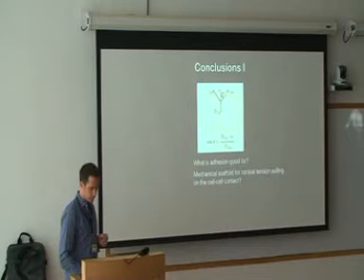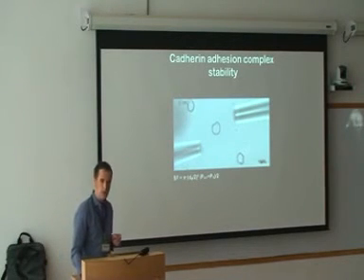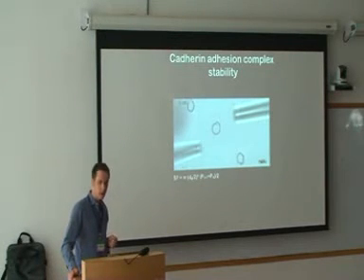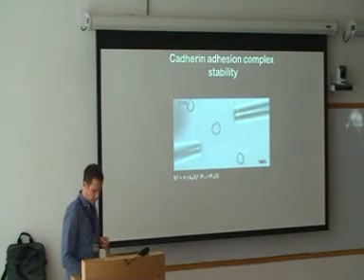So, a mechanical coupling function of adhesion. Okay, here we come back to the pipettes. How can we analyze, how can we determine the mechanical coupling function of adhesion, this mechanical function of linking these contractile cortices together? One way we thought we can do that is actually doing a very similar experiment to what I showed you before, and that is just exemplified here.